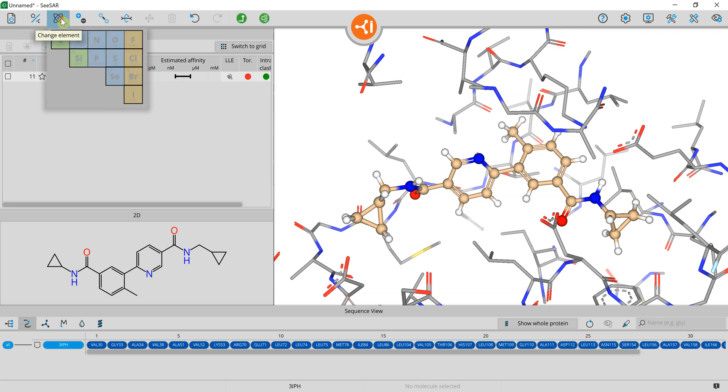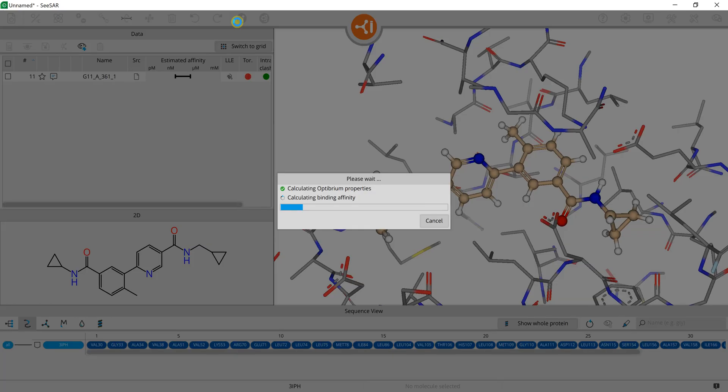After having changed this element, we save our modified ligand to the table and calculate the estimated affinity.